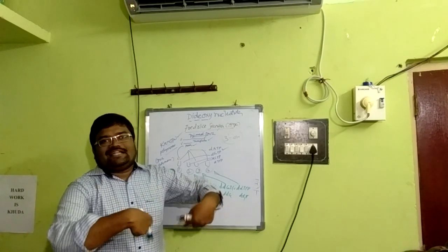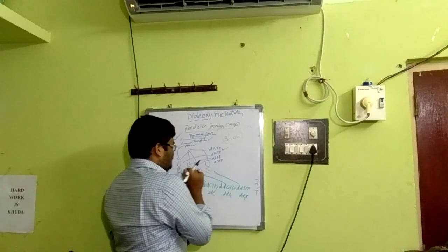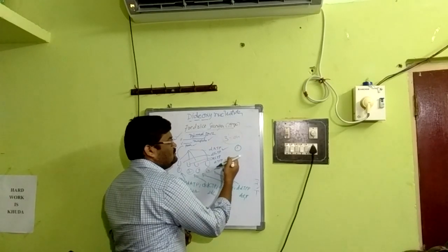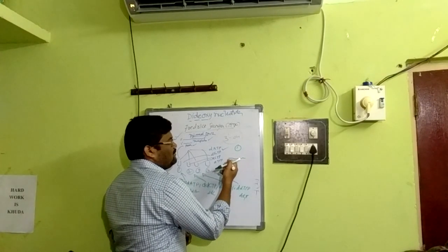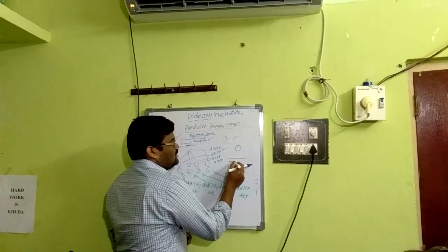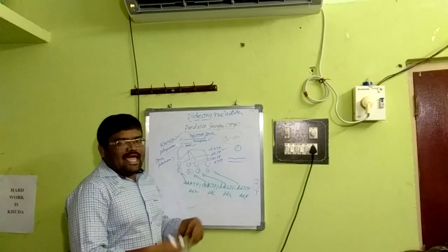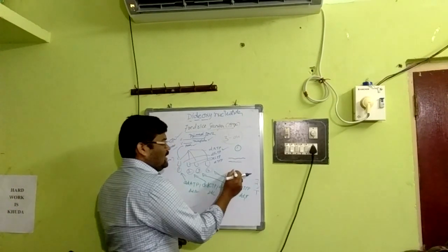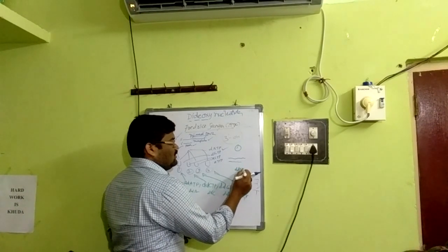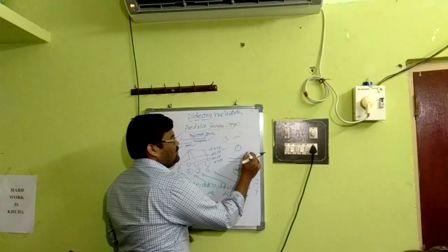You know what happens? For example, take test tube number 1, and this will be the template strand, and the primer. The growing DNA chain continues as usual until ddATP comes into action. If it comes here, it will terminate the chain.